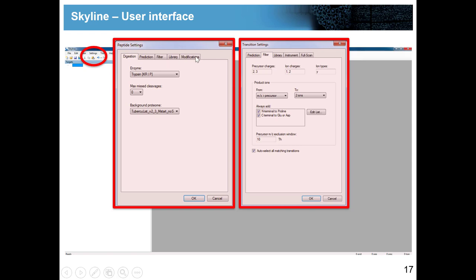In these settings you define in Skyline the whole parameters and information of your experiment. You tell in digestion, for example, which enzyme you worked with and what was the proteome you worked with. You can here predict retention times, you can load the library, you can specify the modifications that you are maybe working with or interested in.